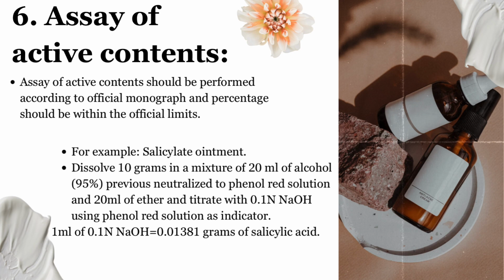6. Assay of active constituent. Assay of the active constituent should be performed according to the official monograph, and the percentage should be within the official limit.